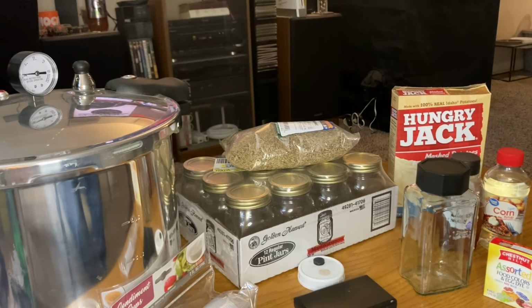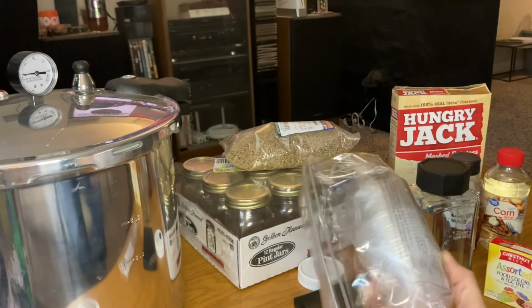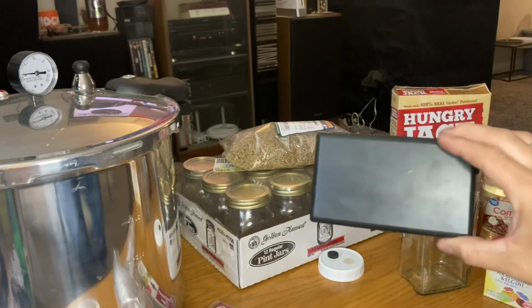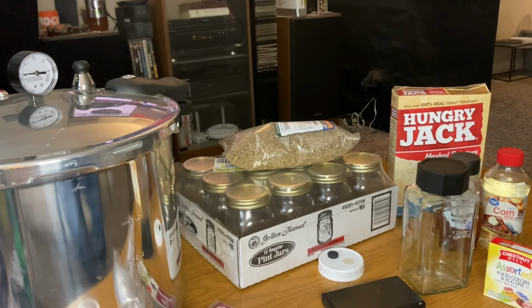But with that being said, I hope you guys enjoyed this video, and I hope it helps with the supplies that you will need. Also, some other supplies before I go that you will definitely need is the condiment cups, unless you want to do petri dishes. These can be found very cheap at just about any grocery store. And you're going to want a scale to measure out your ingredients when you make your agar. Beyond that, that should be everything that you should need.